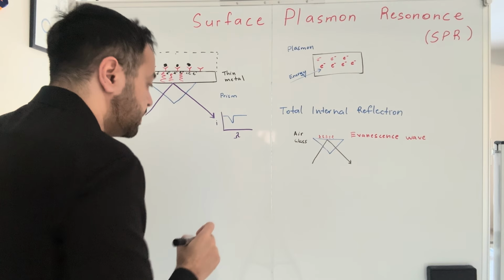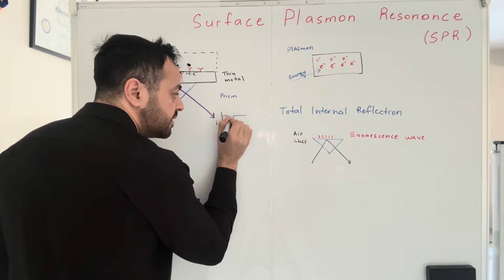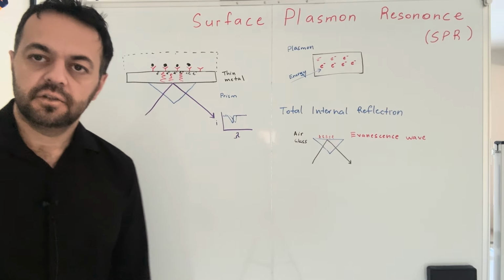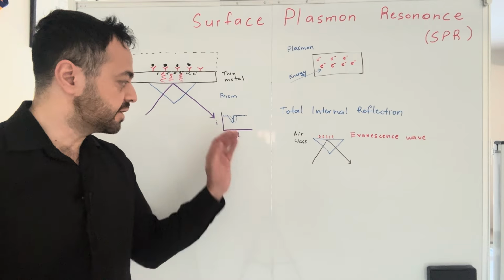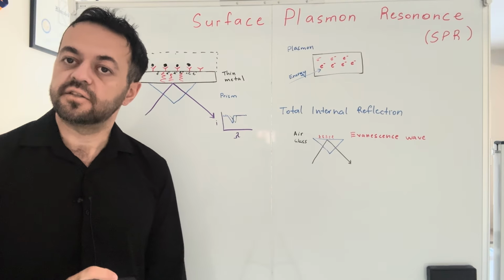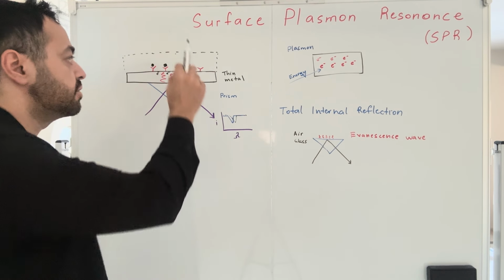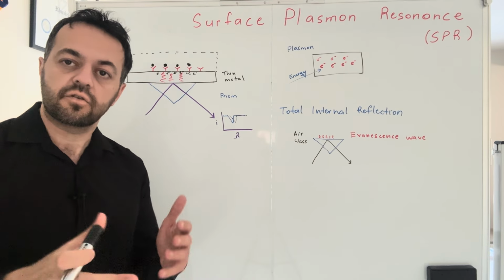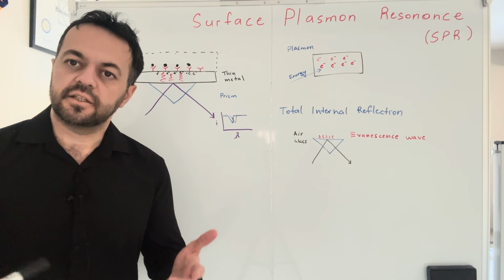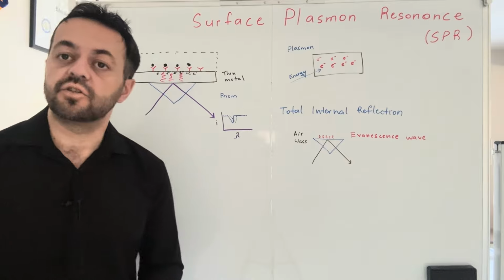So what does it do? You can see a slight shift on the intensity, on the wavelengths. So slightly it shifts. When the curve, you can see shift. From there, you can find out how much analyte, or can see the interaction between analyte, and you can also calculate the kinetics of your analysis. So that's the kind of information you will get.